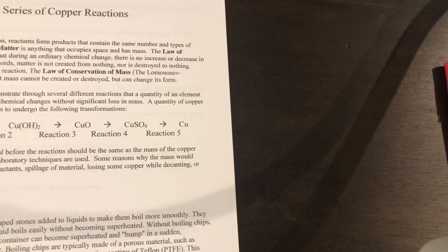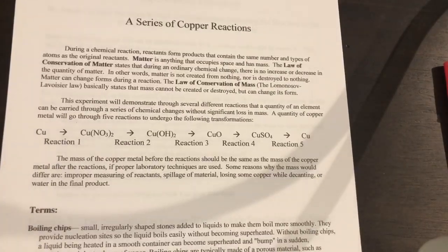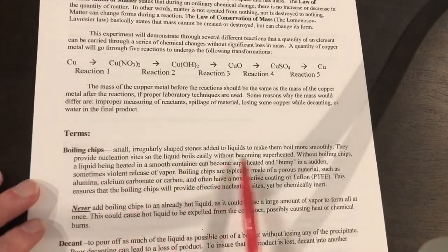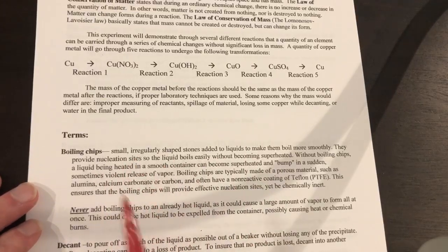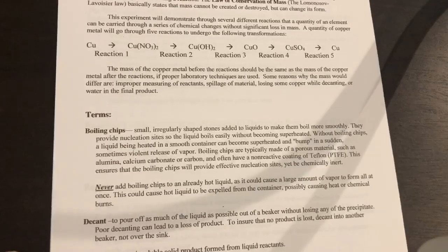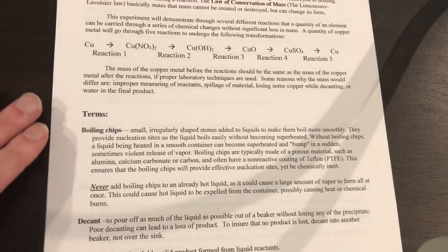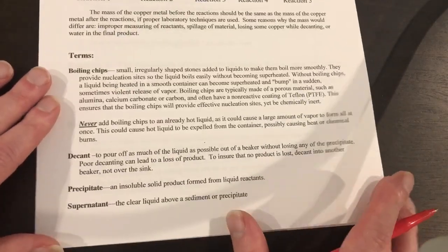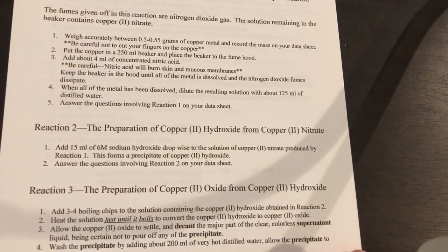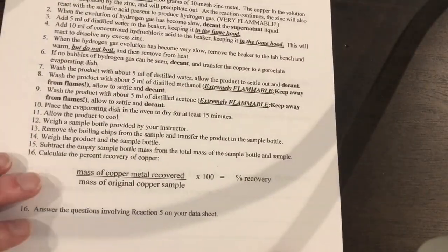Okay, so conservation of matter. We already said that that's super important, that matter cannot be created or destroyed. So we're going to go through these reactions. We already talked about these terms. Boiling chips make even boiling. Okay, boiling smoothly. Decant means to pour off. Precipitate is an insoluble solid formed by two liquids. Supernatant is what we're going to pour off. Okay, so these are the steps of the reaction. So you can read through that, pretty much talk through that.